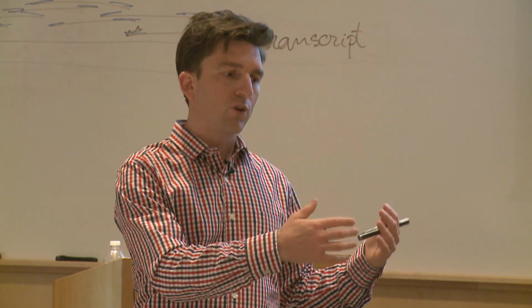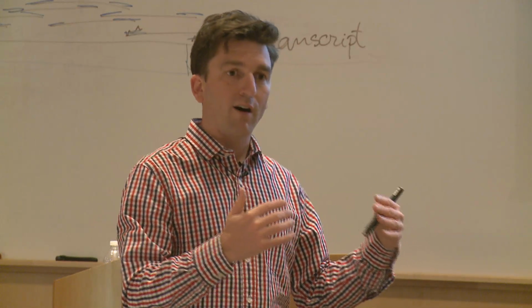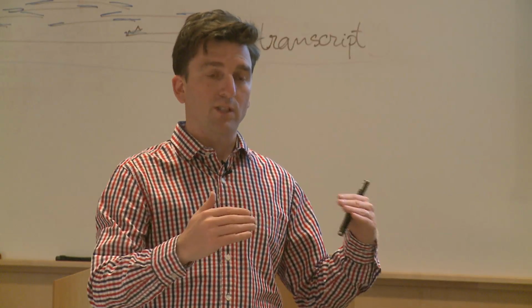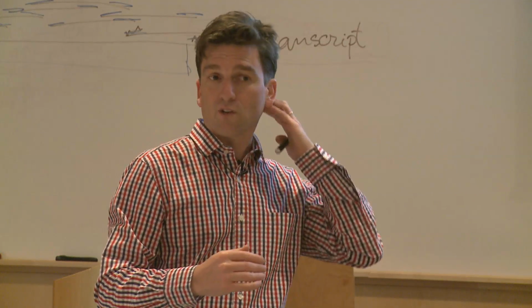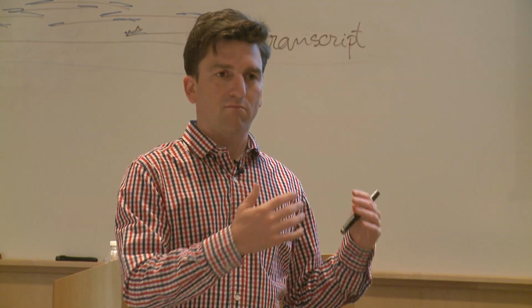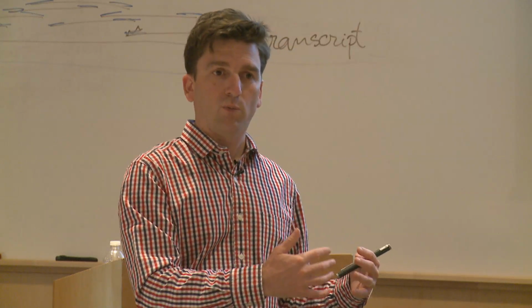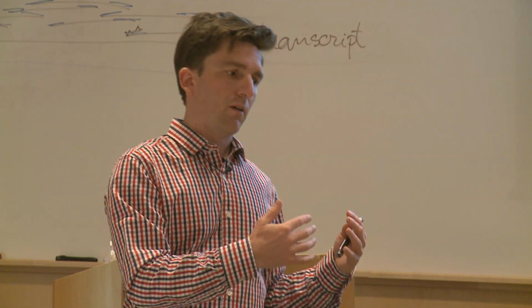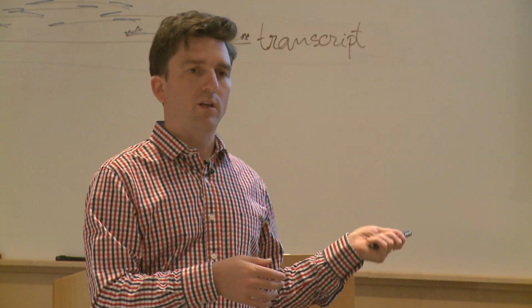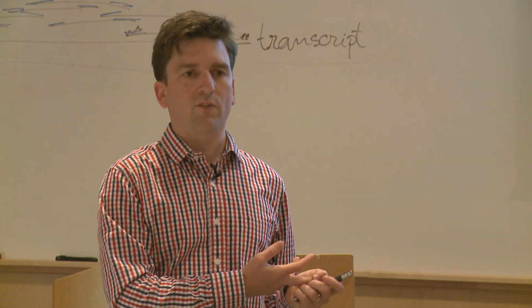You can look in detail at your alignment and say that, in the two conditions, there are genes where the transcript use is not the same. And so it's good that we have tools that can try to go at that level of resolution and take full advantage of the data that we produced. To work as nicely as described here, you need a lot of reads and very high quality reads. And usually it's better if you have good annotation as well.